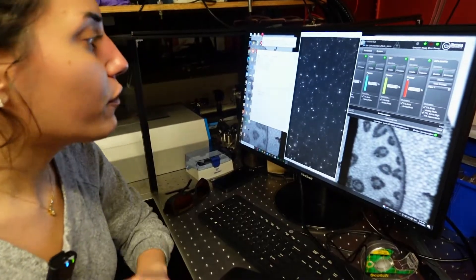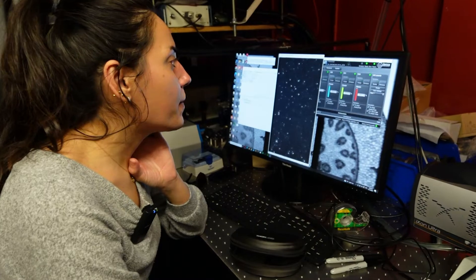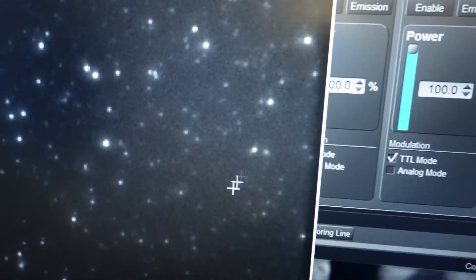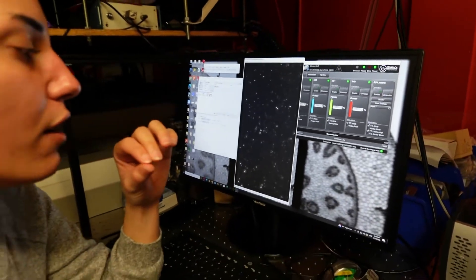The power of the single molecule fluorescence microscopy, it allows you to actually see the behavior of each individual particle or molecule that you're actually measuring. What you're seeing here is the behavior of individual quantum dots. And as you can see, each quantum dot is actually exhibiting a blinking behavior, which means it's turning on and off over time. And so we can actually show people a piece of equipment that can quite literally see and count individual molecules.